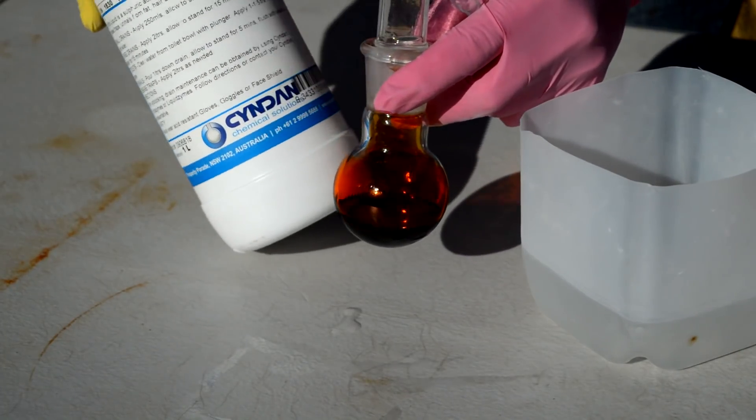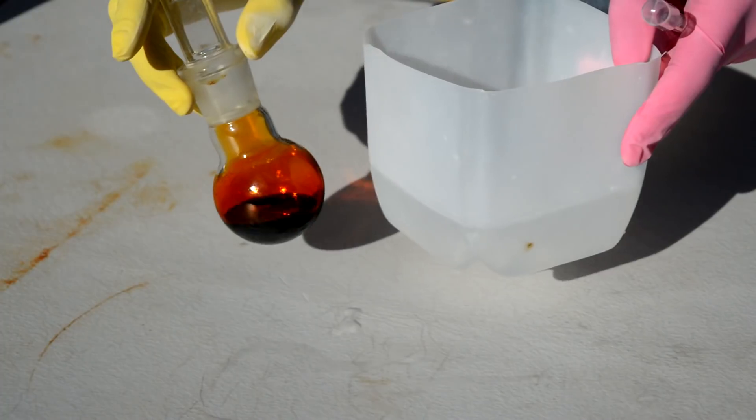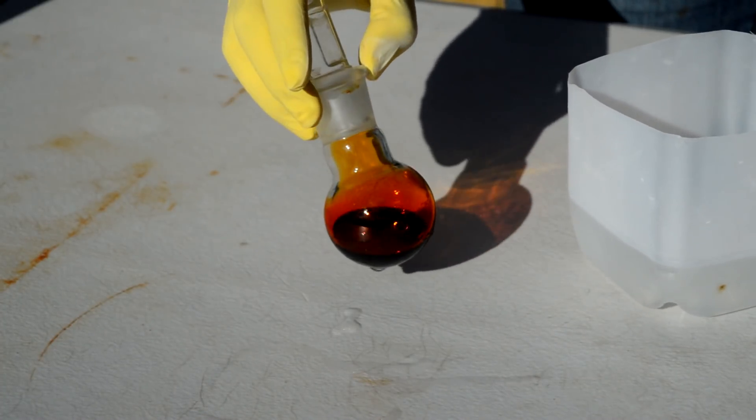I did it last time, but obviously I didn't do it that well. Just cooling it down on some ice, because it's always a good idea before adding sulfuric acid to things — you cool them down, especially if you think it's got a bit of water in it.